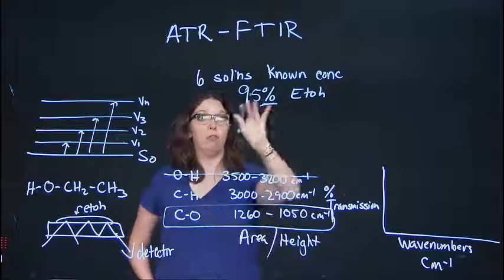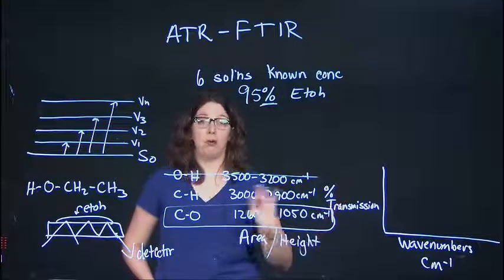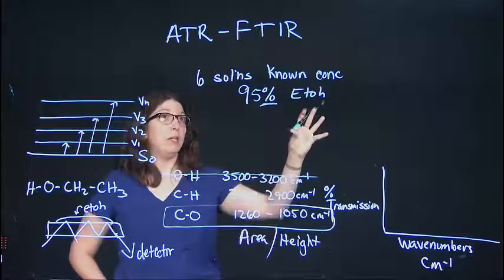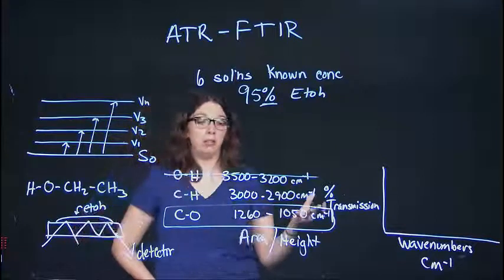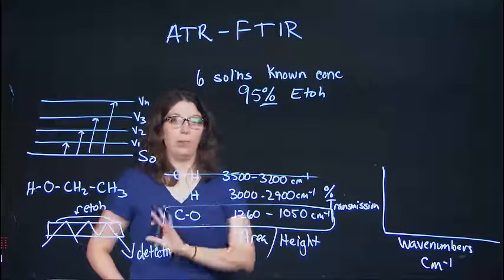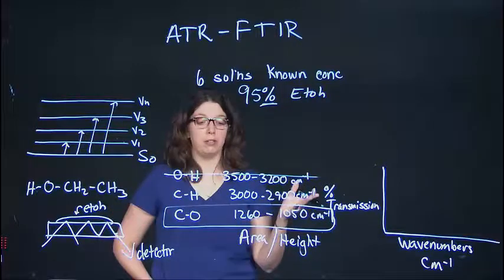So if you make your calibration curve and your x-axis is in percent ethanol, that's perfect. Yeah, so make these solutions. You don't need to make a ton of solution, maybe 50 milliliters of each standard, okay? You're going to use like 1 or 2 milliliters per standard, so use the smallest volume possible.